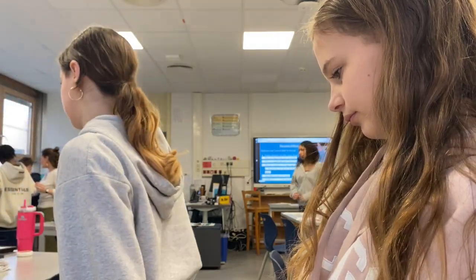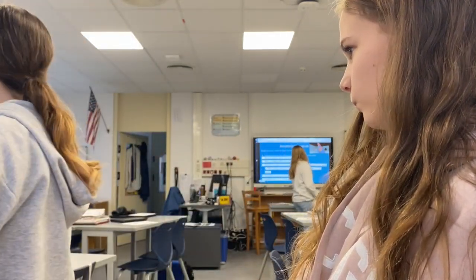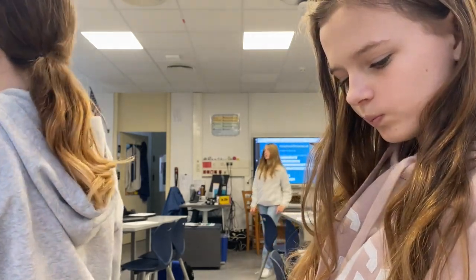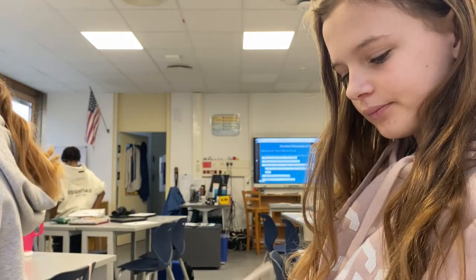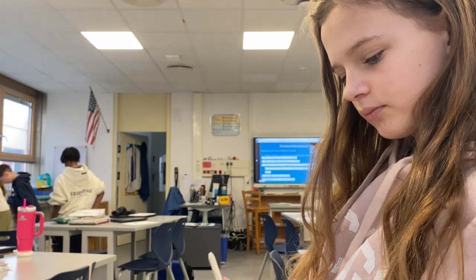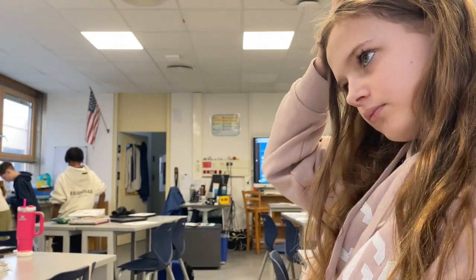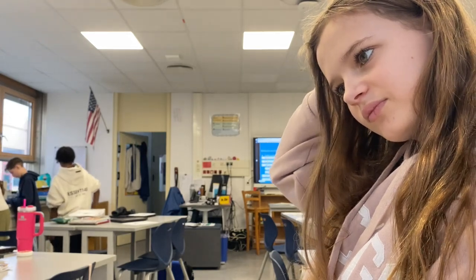There we go. You should put it on at a 45-degree angle, or fix that so it's even. And then your cover slip. Okay, hold on. Do we plug it in now? You're going to put it on like this so that you can read it. Good to go? Okay, let's do this.